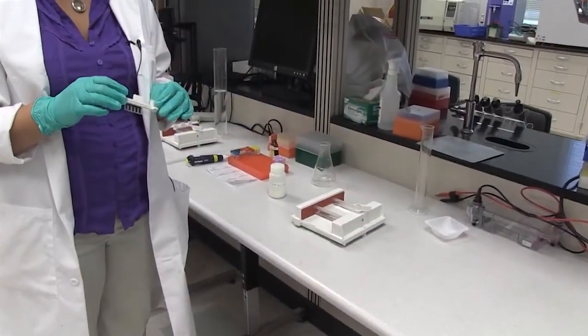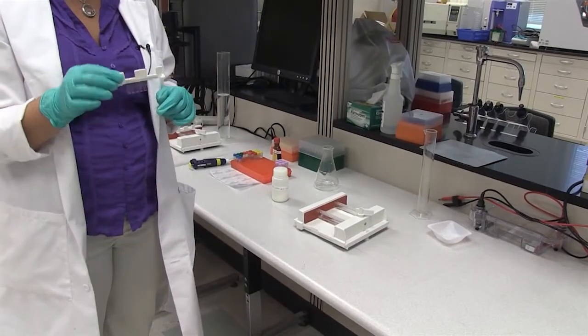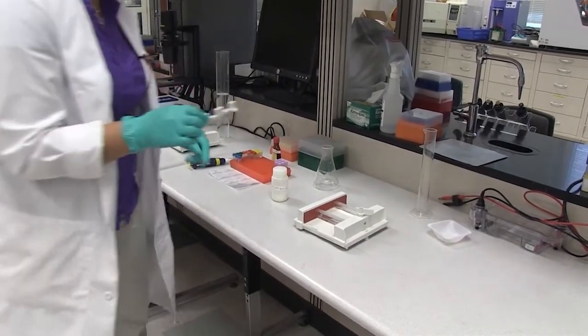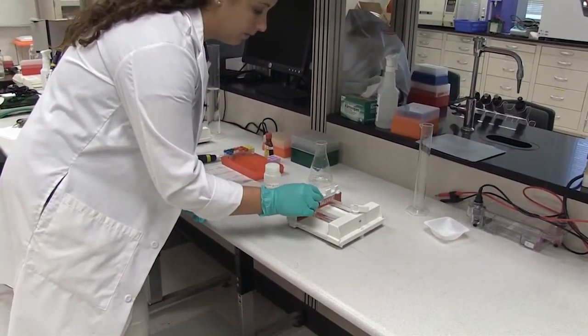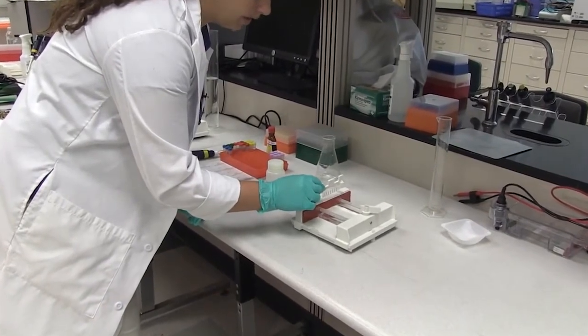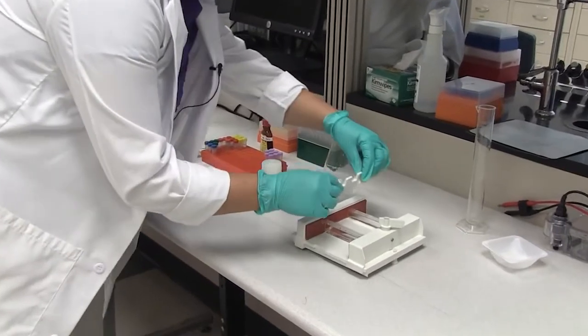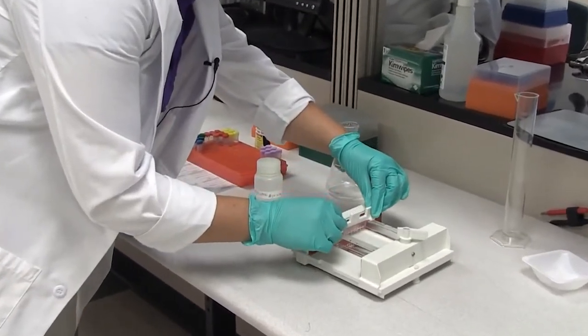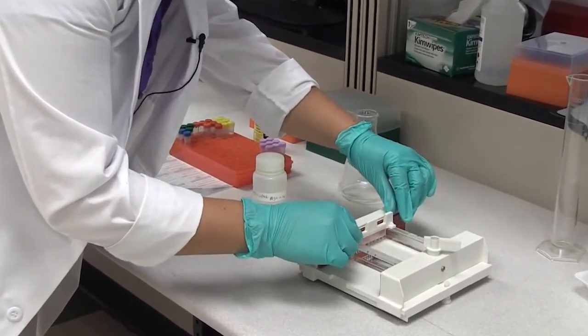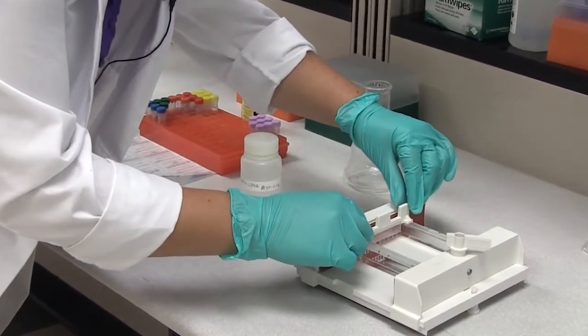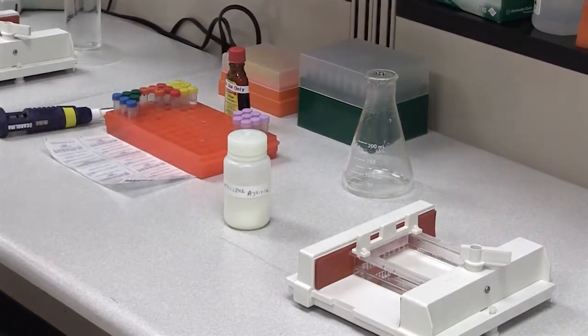We're going to take our comb, we're using an 8-well comb, and we're going to place it in the agarose gel before it starts to dry. We don't want it to be pushed all the way up against the end of the rubber dam. There's actually a little holder that fits in to secure your wells in place.